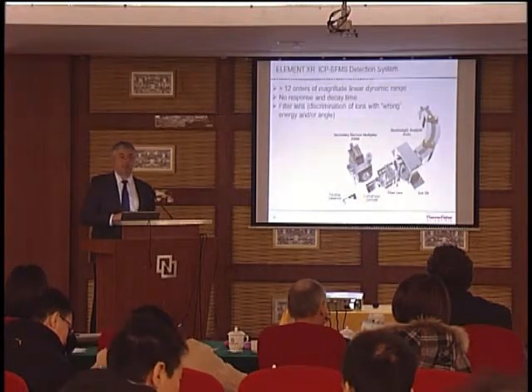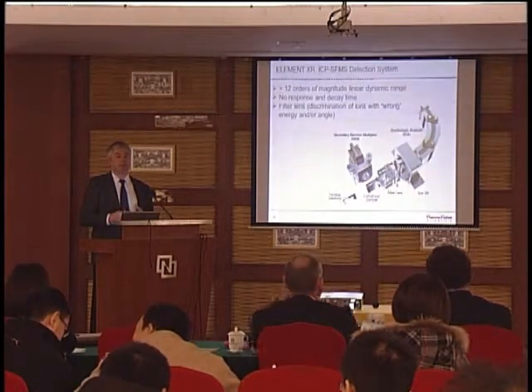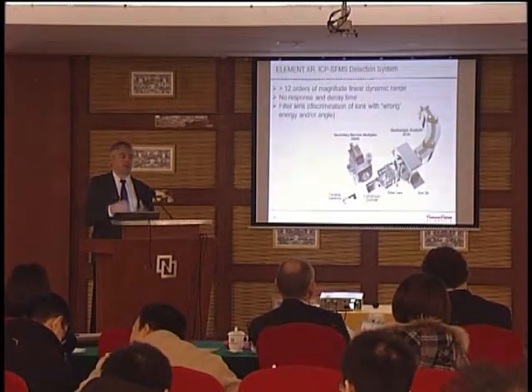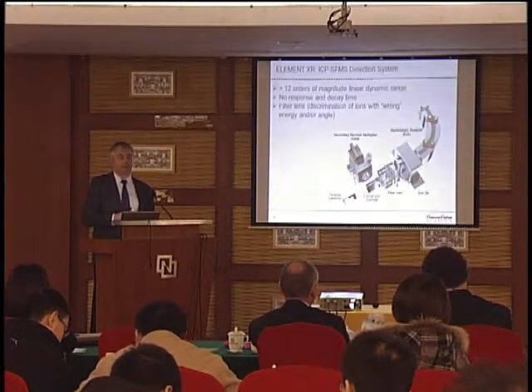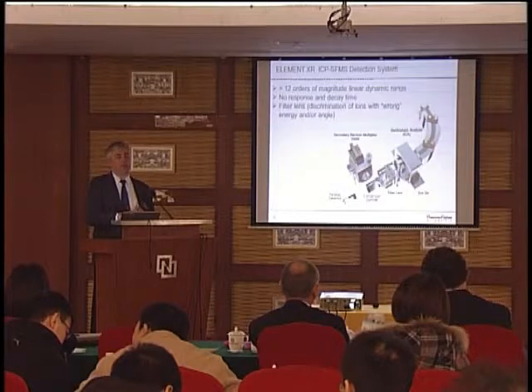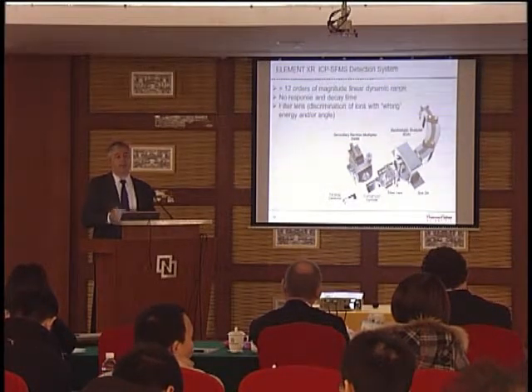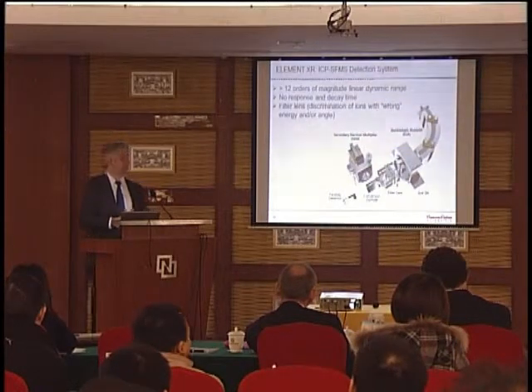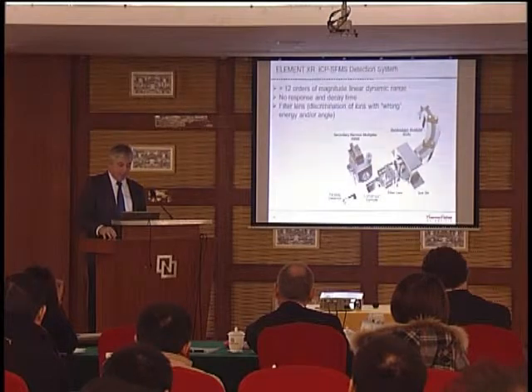This is to improve abundance sensitivity, and you may know abundance sensitivity is an effect which is caused by ions that make collisions in the analyzer with residual gas molecules. And by these collisions, they lose a little bit of energy, but also get a slightly different angle. And you can discriminate them by an ion optical system, which we call the filter lens.